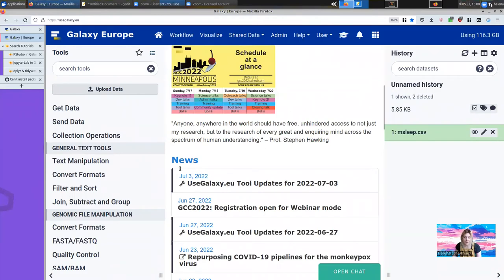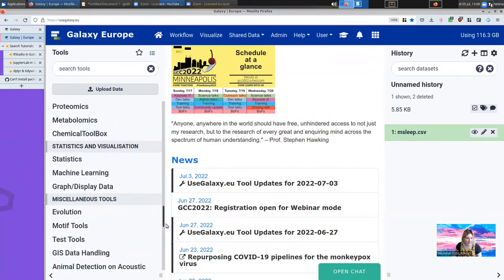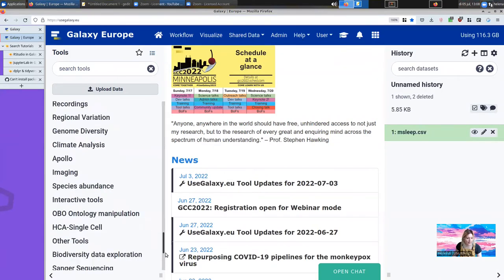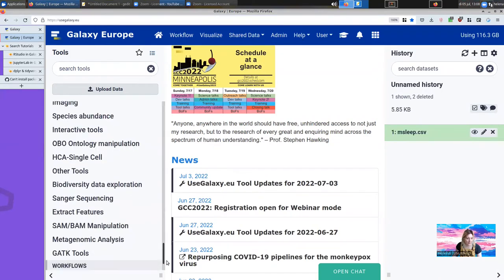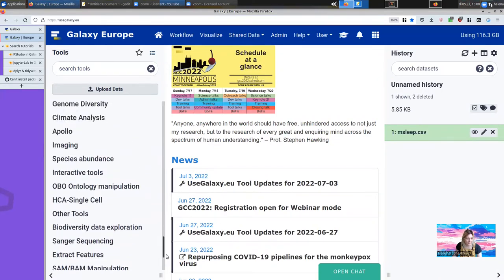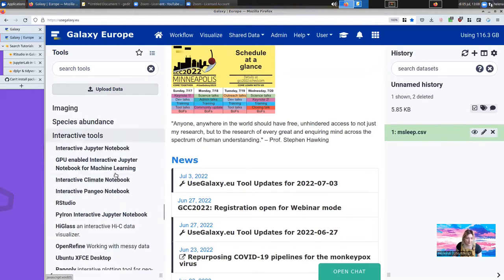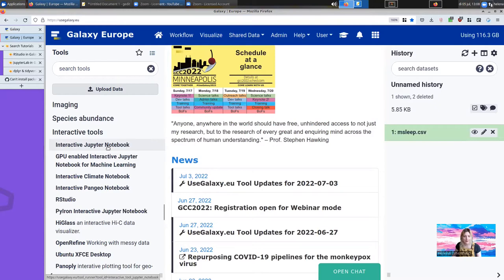On usegalaxy.eu, there's a section down at the bottom called Interactive Tools and there you'll find all of these different interactive tools that you might want to use. In that section we have a lot of different options, all of the same ones on live.usegalaxy.eu.